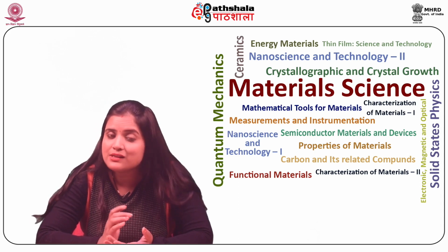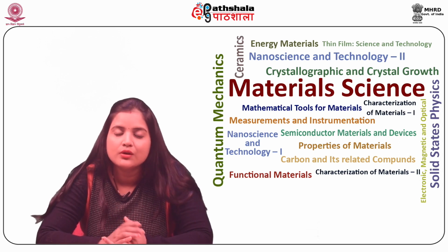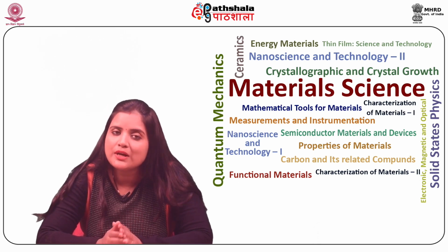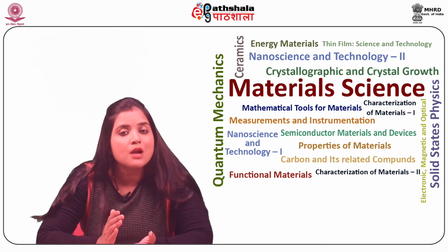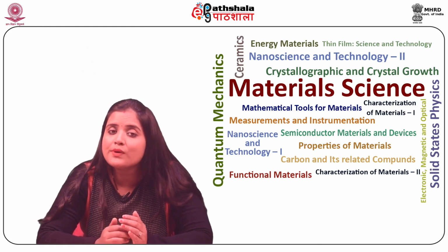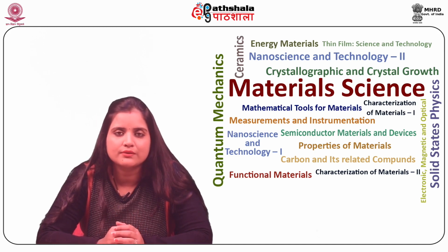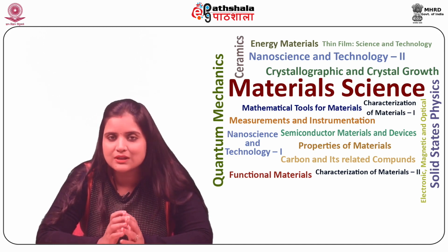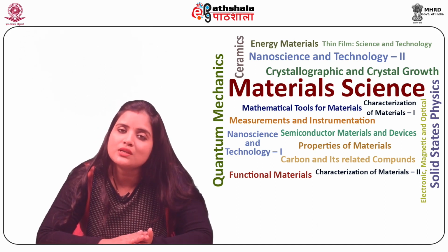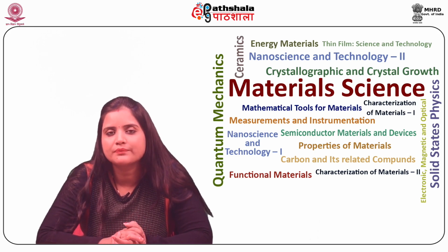STM scans the sample surface in a raster fashion. To create an image, specific values depending upon the type and mode of STM are recorded while the probe is rastered over the sample surface. A map is created from these values which produces the final image of the sample surface.